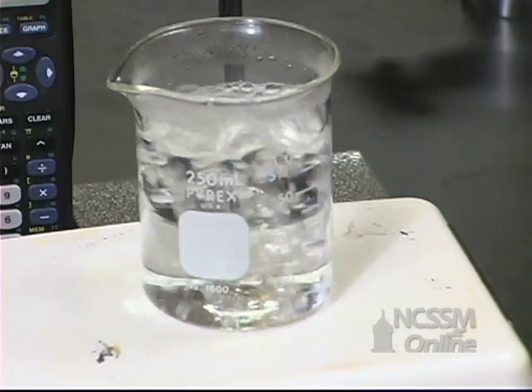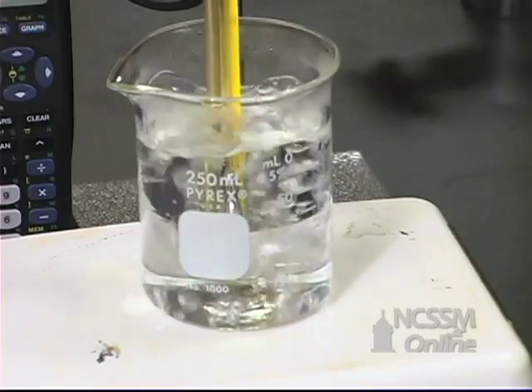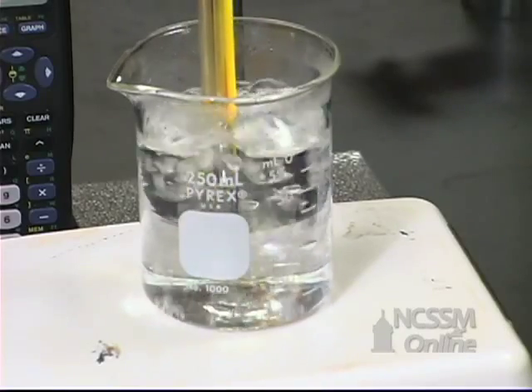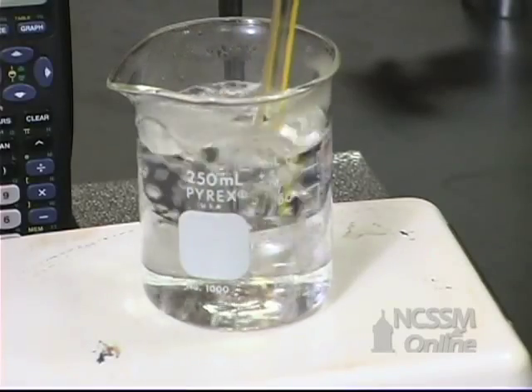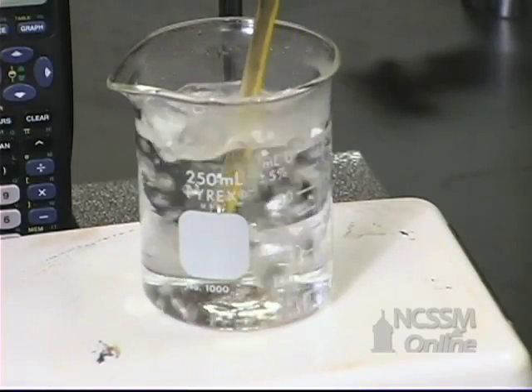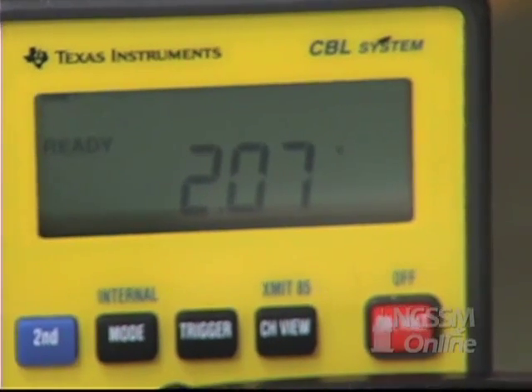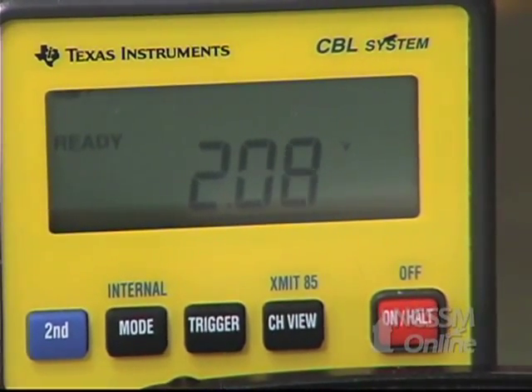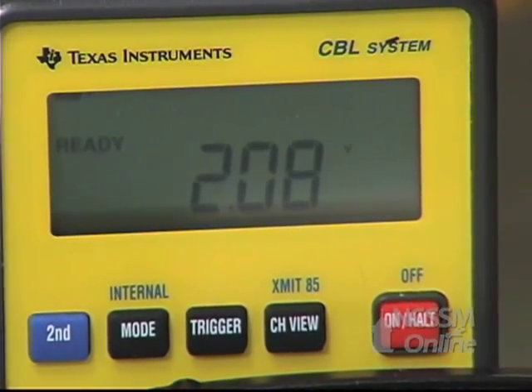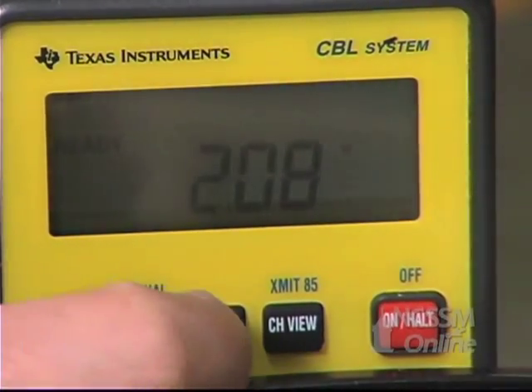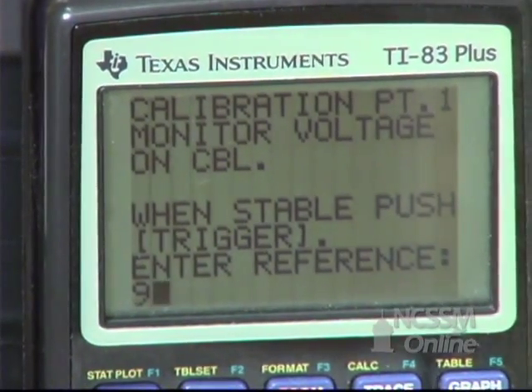We're going to place the temperature probe and a thermometer into a boiling water bath. We're going to wait a minute or two for the CBL reading to become stable. When the reading becomes stable, we're going to press trigger on the CBL and enter the temperature from the thermometer.